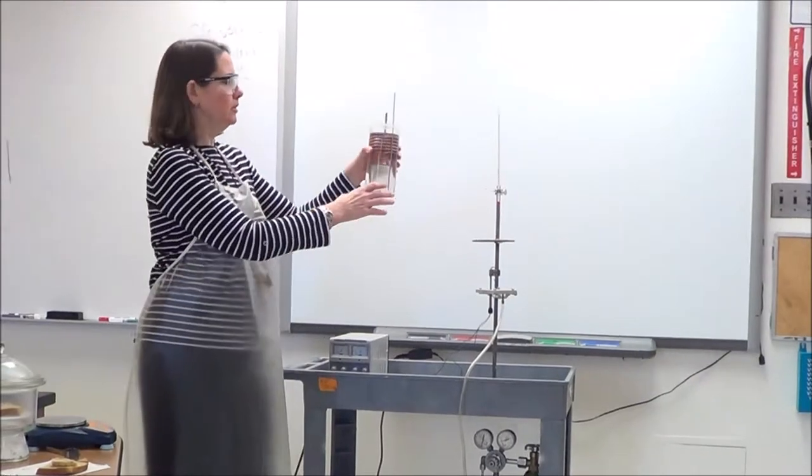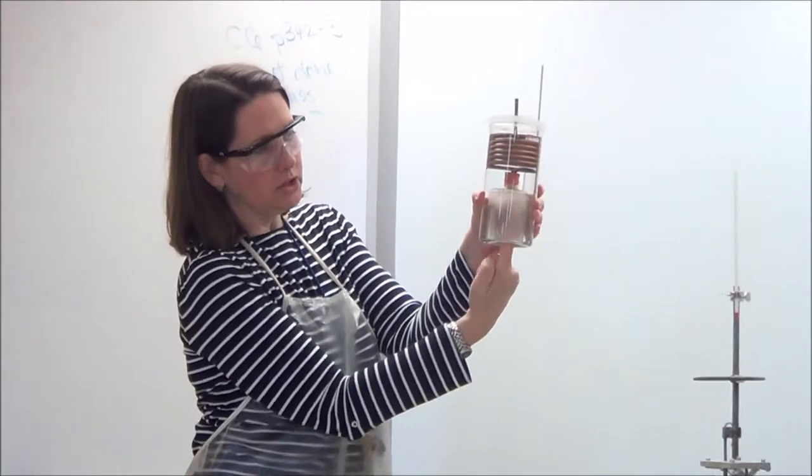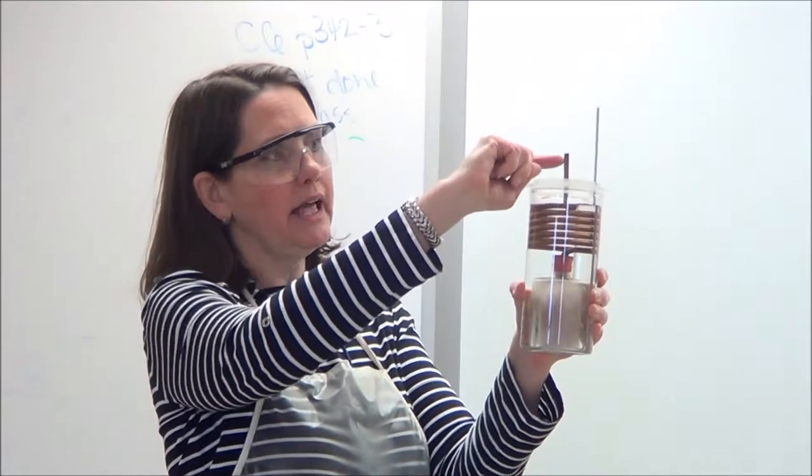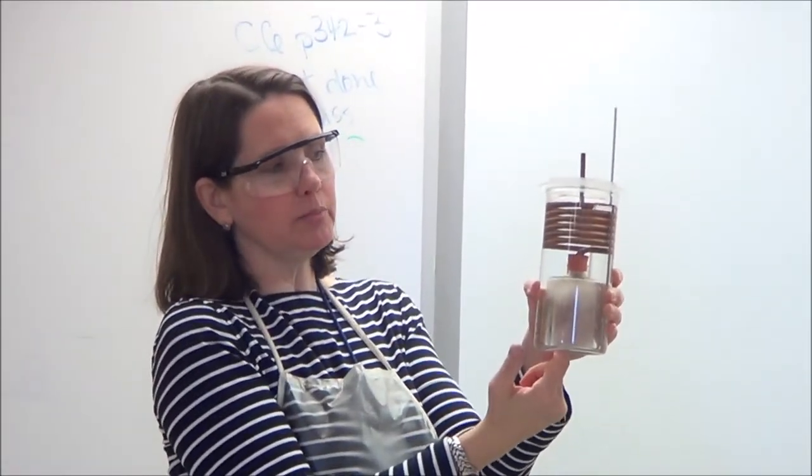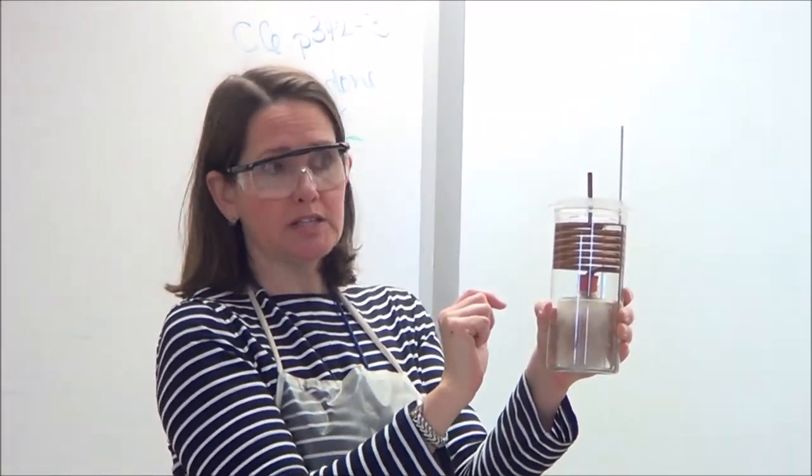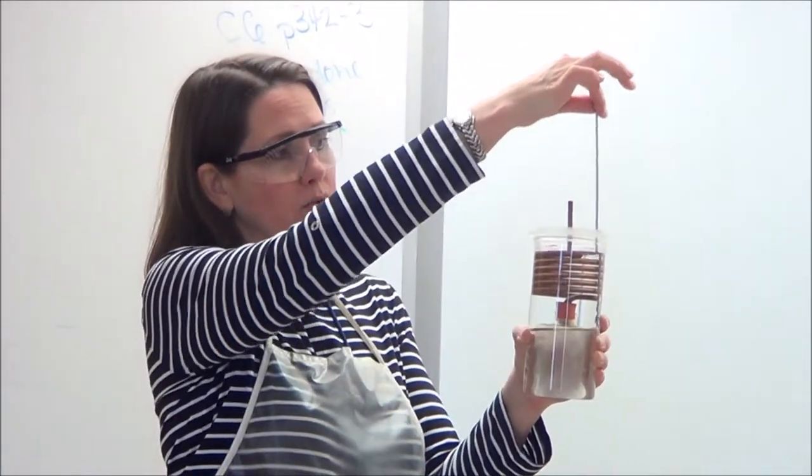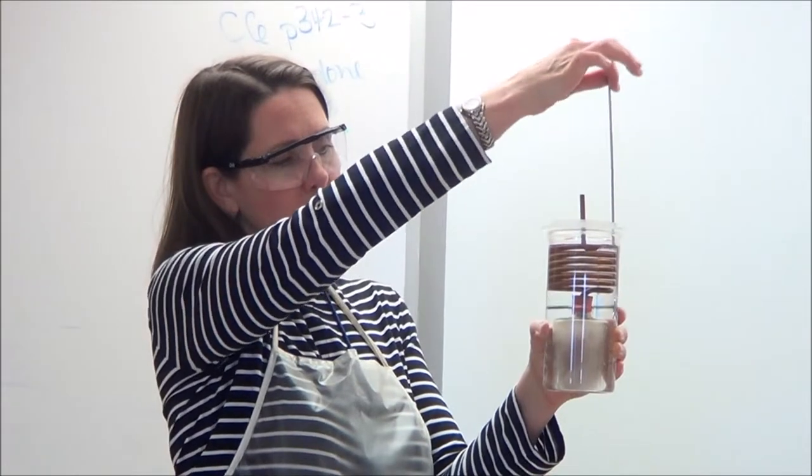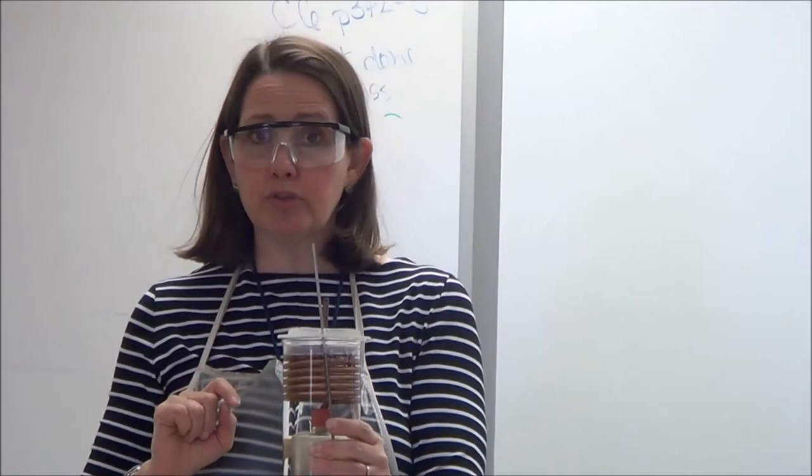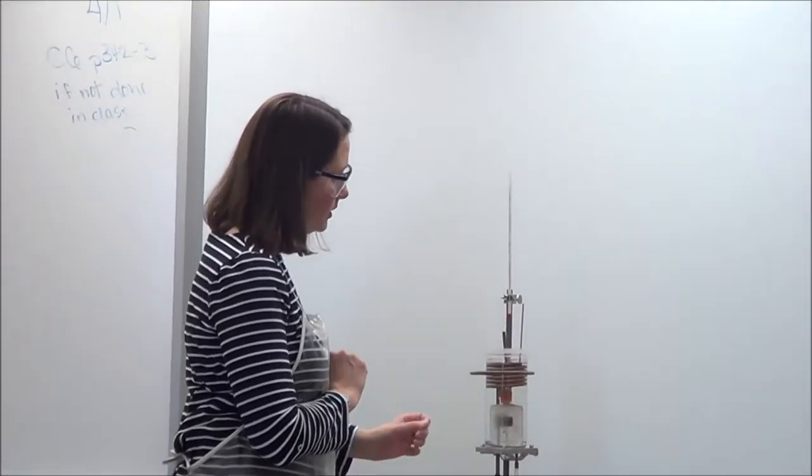Here's the actual part of the calorimeter that we need to look at. This has water in it. It's a glass container with a little open space in here connected to copper tubing that coils through the water and has an opening here so that gases that get released during the burning can escape and also so that they can release as much heat as possible to the water on their long escape through the copper coil. There's a spot for a stirring device here that allows us to stir and move the heat through the water. And then there's a little hole here for the thermometer to go.